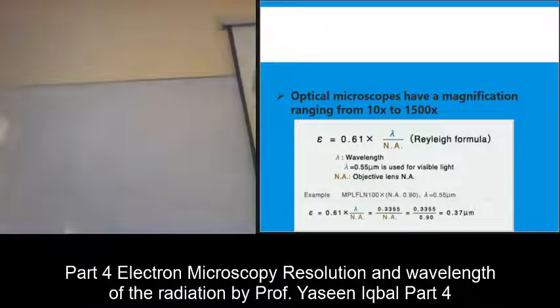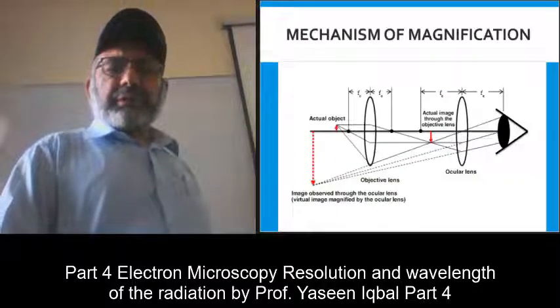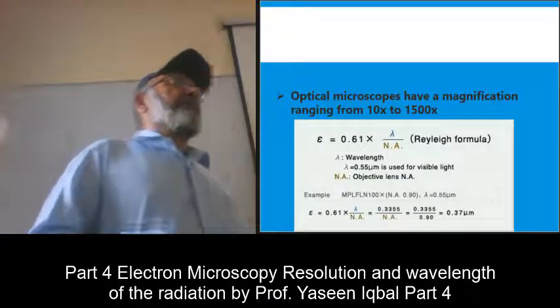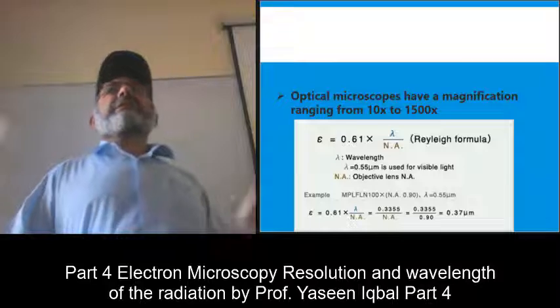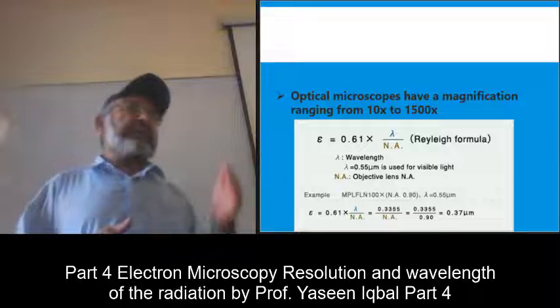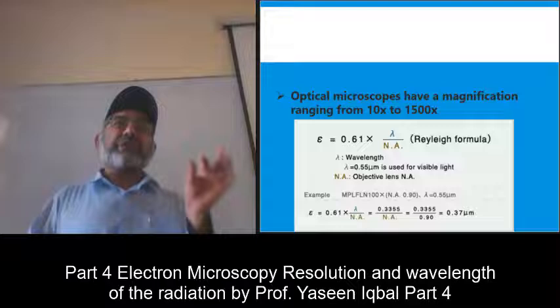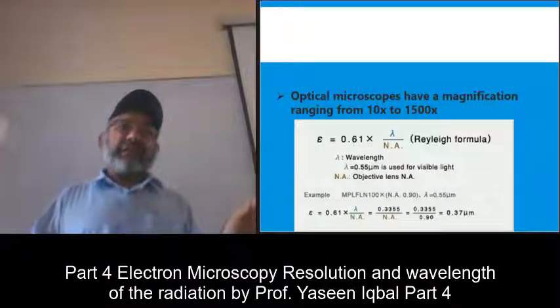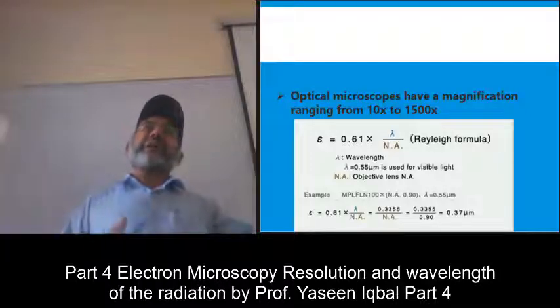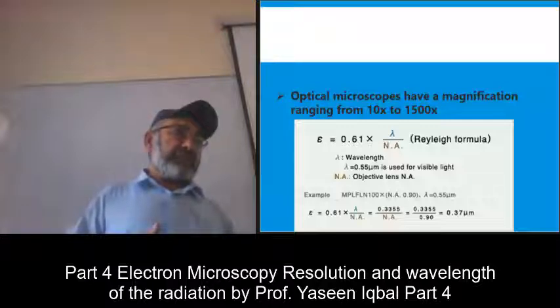In the previous lecture, I was telling you that the wavelength determines the level of resolution. If the wavelength is shorter, then you will be able to resolve smaller things. If the wavelength is longer, then you will not be able to resolve smaller features, right?